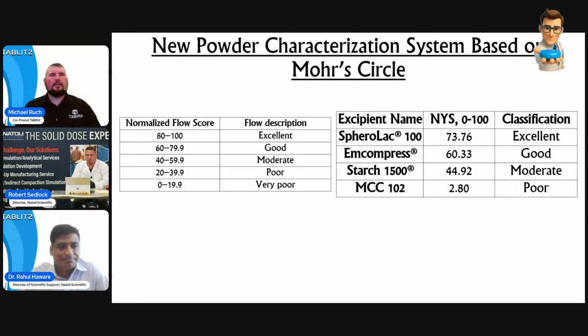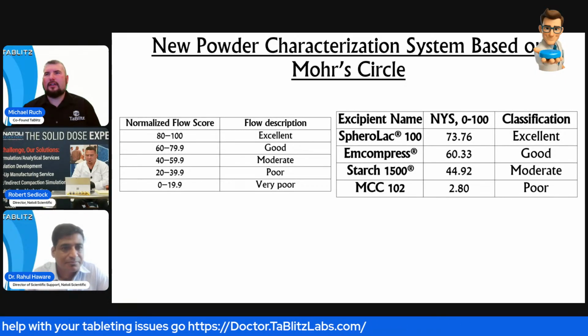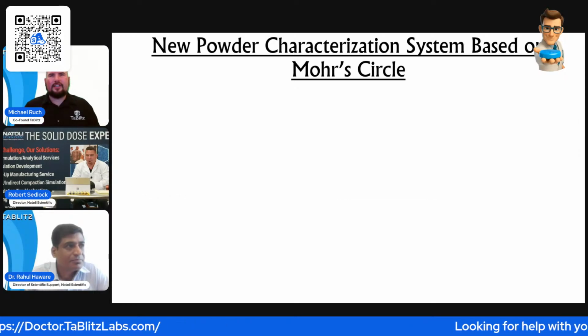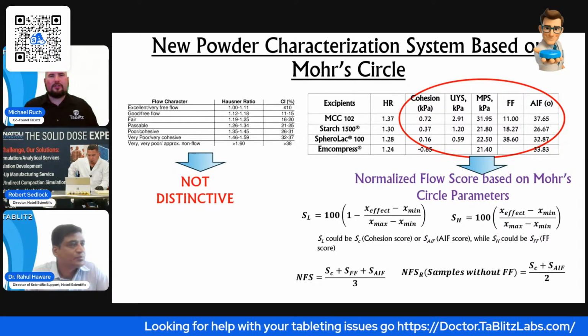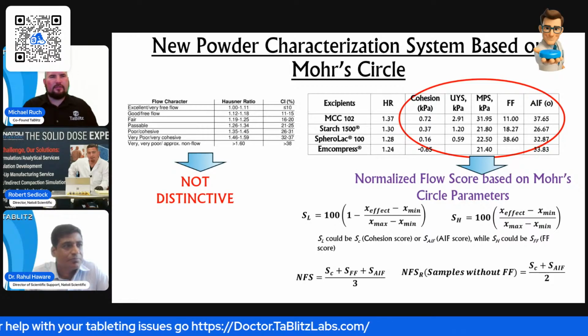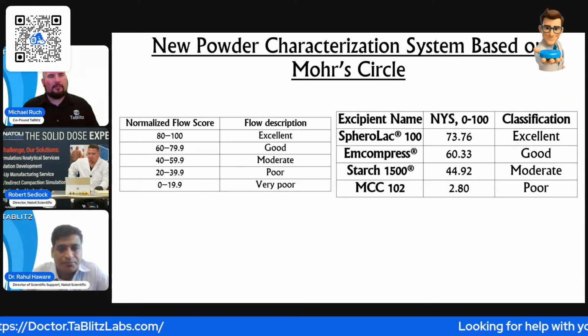Okay. All right. Well, I think we're 3 minutes over, so we can start taking some questions. But going back to this comment here by Robert, that classification is kind of a guiding line of what we should be looking at. But by testing individual powders or excipients, it also gives us a goalpost of what we should be incorporating to balance out our powder mechanics, right?